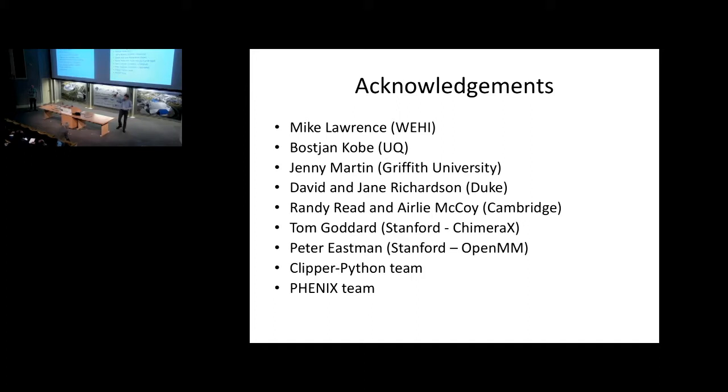But ultimately, I am obviously aware that many people will want to just keep using the mouse, so I'm absolutely committed to making sure mouse support works well, and adding as much as possible those scripted helper forces so that your actual direct interaction with atoms doesn't have to be enormous.